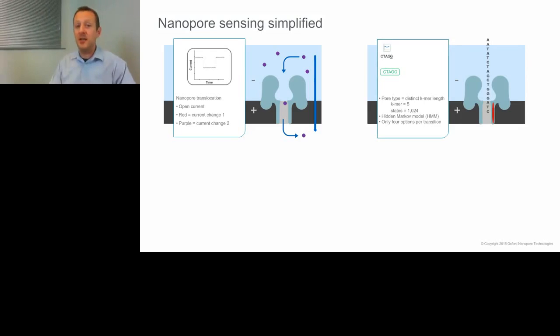When we come to look at DNA, the bases are joined together, and in the method which we call strand sequencing, DNA molecules pass through the pore like this, intact. When the DNA passes through the narrowest part of the pore, it chokes off the current. Several bases can fit into the narrow bit of the pore at any one instant, so we're actually measuring the current from a short word, rather than from an individual base. If 5 bases fit into the narrow part of the pore, then we're reading 5 bases, and we have 4 to the power of 5 different combinations because of the 4 different types of base. So that's 1024, which means that we have to fit 1024 different current levels into the detection range.